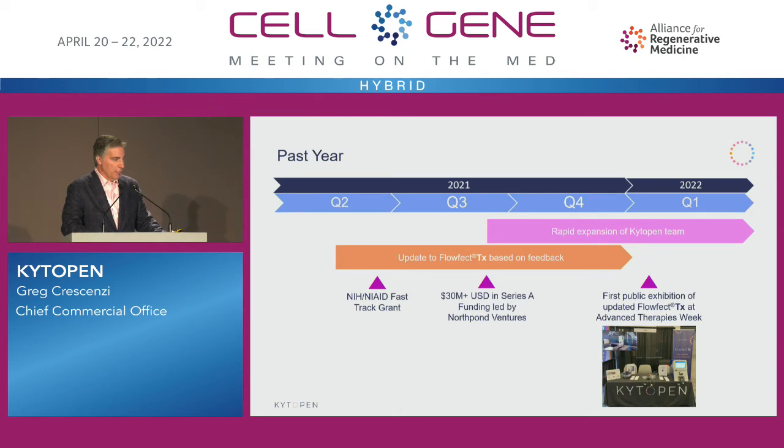So we've been quite busy over the past year. Mid-year, we did a comprehensive usability study with over 12 representatives from the industry on what we called our Gen 0 at that time. Feedback from that was that the device was too big for the bench and had some other limitations. So we took all that to heart, and we decided to take some time to rework the system that you can see there, which was first debuted at Advanced Therapy Weeks in Miami earlier this past January.